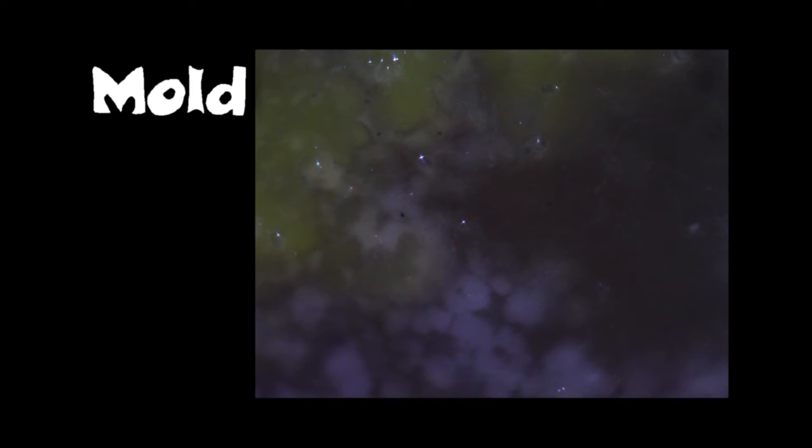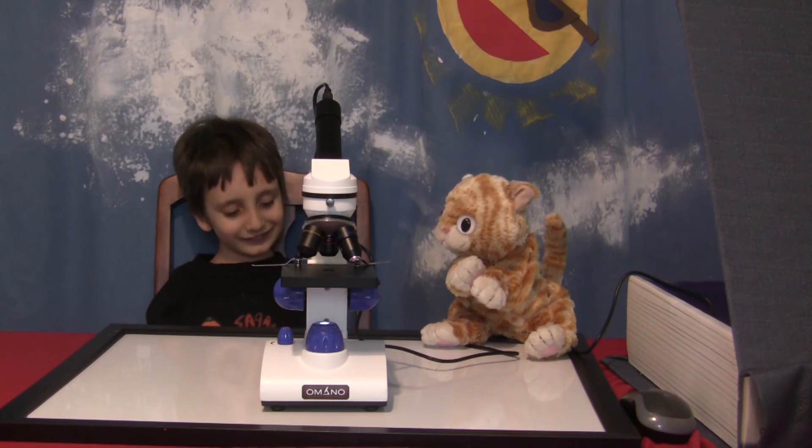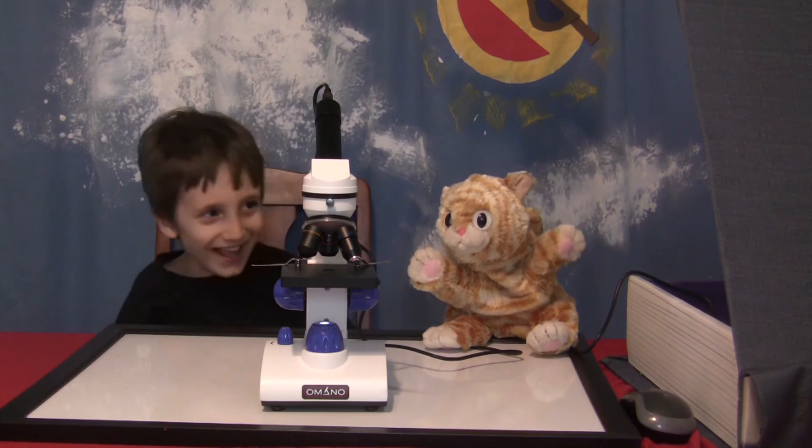Doesn't it look like outer space? Now it's like a nebula. Things in my kids go really weird. Kids, look at that!